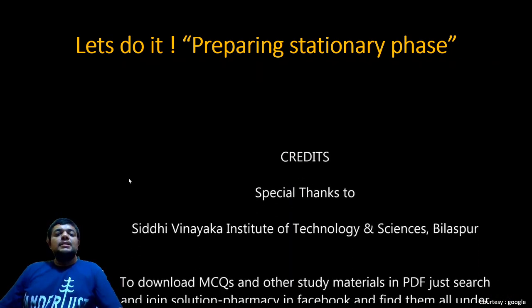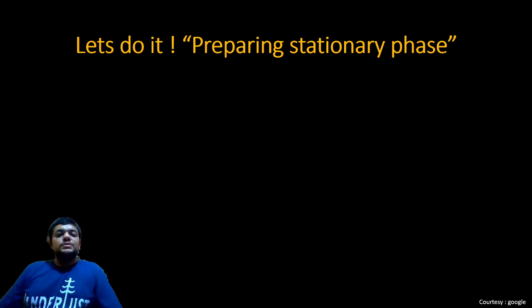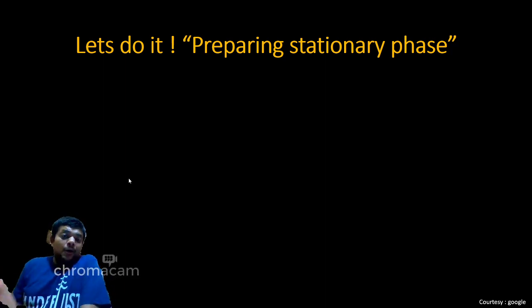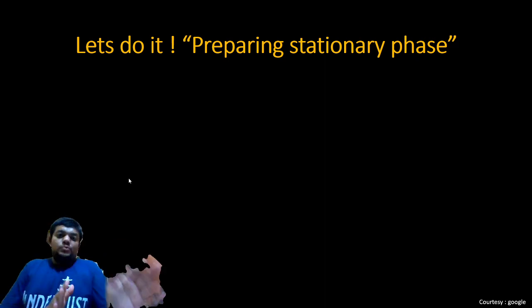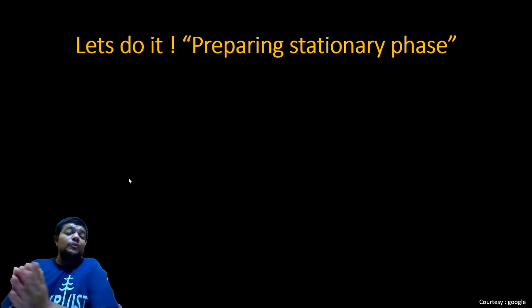So friends, this is a credit that has to be given to this institute who has prepared this video and posted it on Google, from where I have got it. When Madam was describing this whole process, she said minimum 1 hour in the oven, but you can use this plate after, or up to, 3 days. So from 1 hour to 3 days, don't place it outside, keep it inside the oven. Henceforth, I have written that sometimes it needs to be placed inside the oven for 24 to 48 hours.